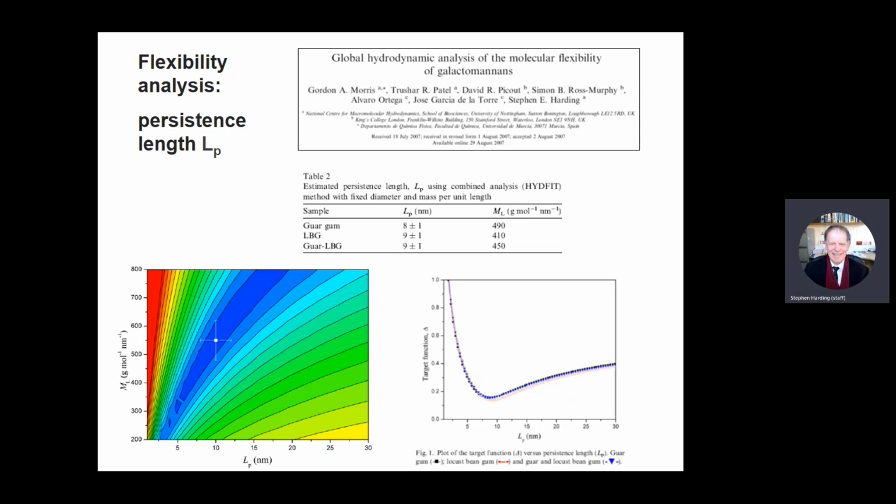You don't need to know the detailed physics behind all these methods. That's not what's required for biomolecular technologists, but just an idea how these techniques work and the sorts of information they can give you, how they complement each other. I mean, some of these methods give the same thing, like the weight average molecular weight. And that's why we call them orthogonal techniques. Fancy name the field uses, orthogonal. It doesn't mean right angles, it just means different ways of getting the same thing.